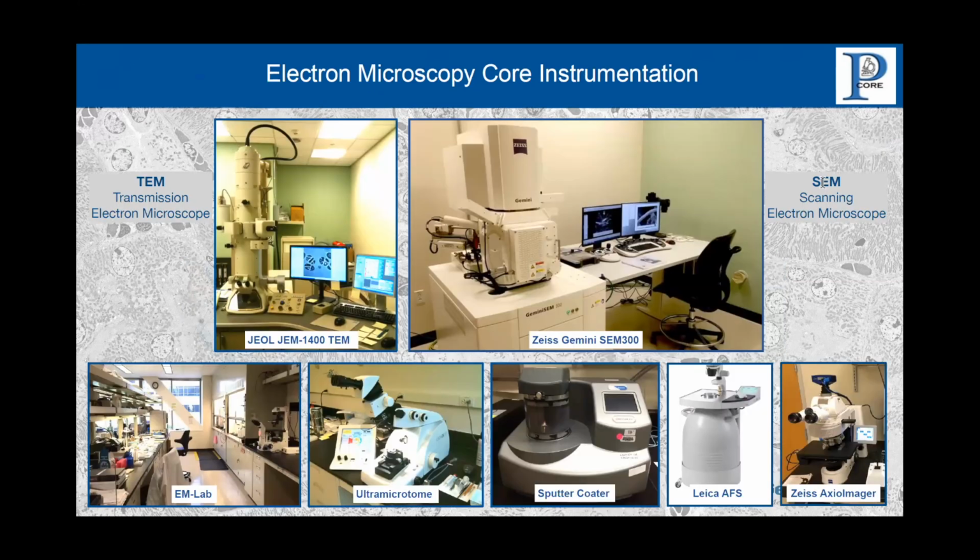Now, because we are a small group, we use two major microscopes, a transmission EM and a scanning EM. And I'm especially in love with our Zeiss Gemini scanning EM, which I will talk about in the next slides.